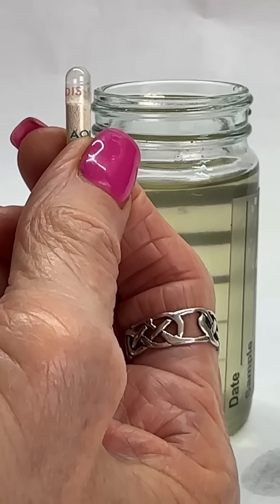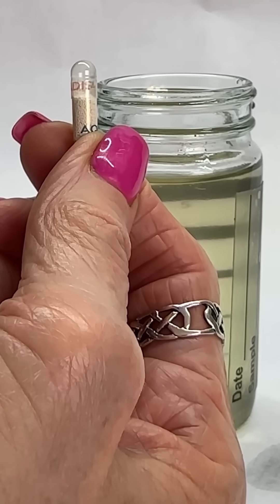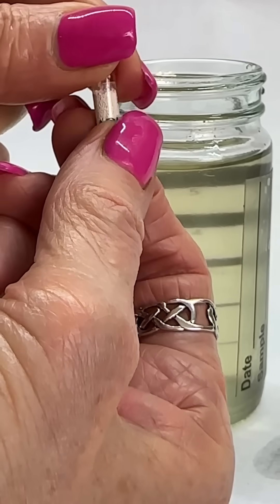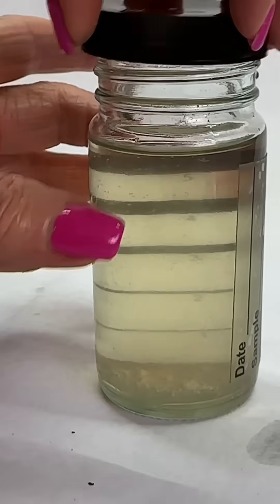This is sample number two. We're now going to open the capsule and put the powder into the fuel. Take the top off, pour that into the fuel, put the lid back on it.